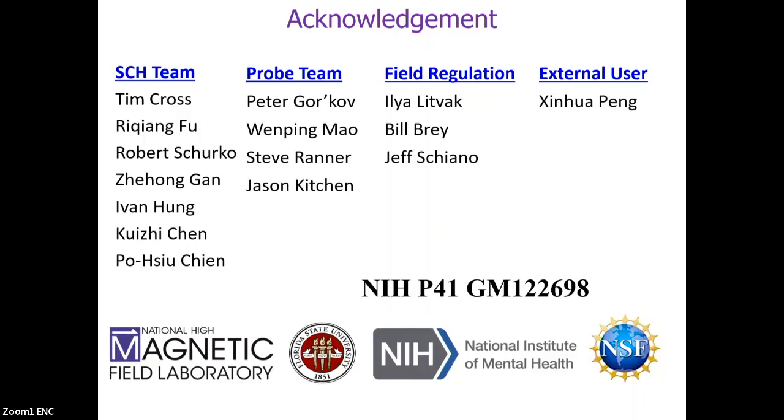Yeah, that's actually a good question. And we did not try that. And we certainly can. But for most of the studies here, we try to maintain it above the physiological phase transition temperature, such as that we were able to align, like the DMPC, we have to maintain about 22 degrees to align the lipid bilayer. And we also try to study this physiological condition.